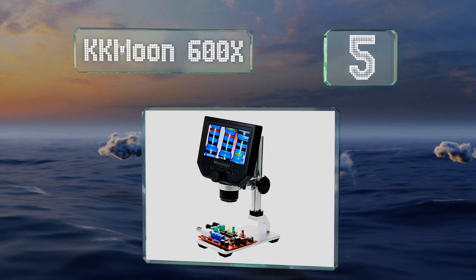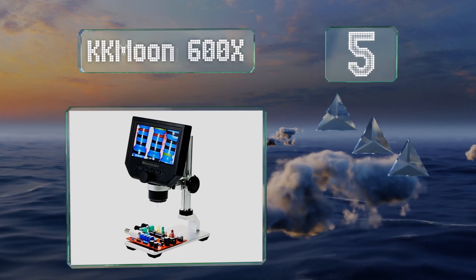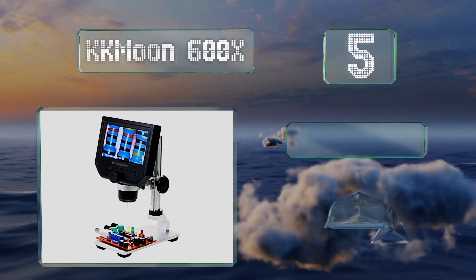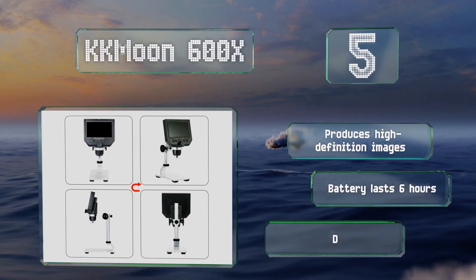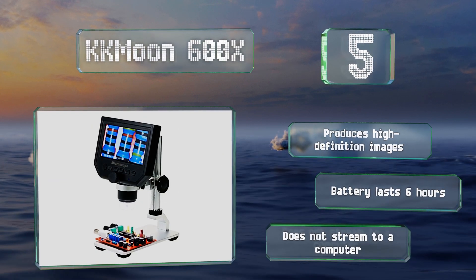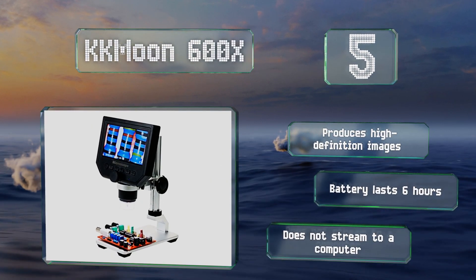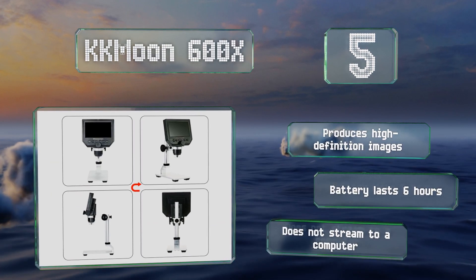Moving up our list, number five: made of plastic and aluminum, the budget-friendly KK Moon 600 times has a 4.3 inch screen that should be sufficient for most purposes. The camera height is easily adjustable via a large wheel on the bracket, which is mounted onto the sturdy metal base. It produces high definition images and its battery lasts for six hours, but it can't stream to a computer.